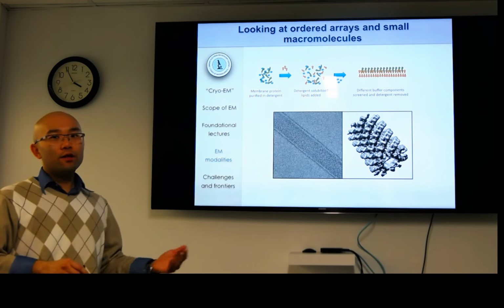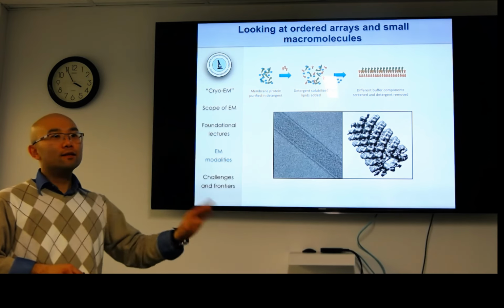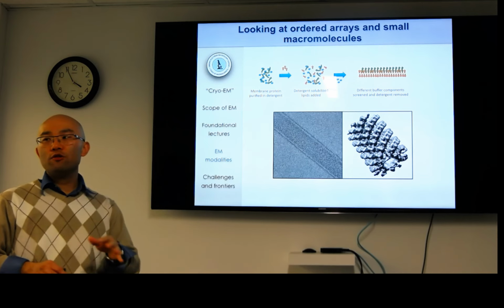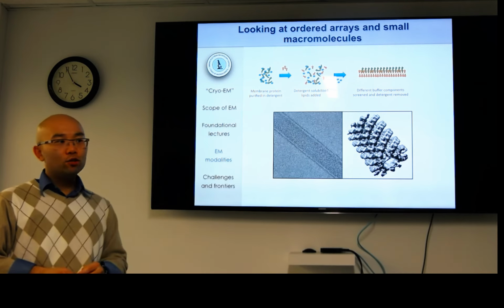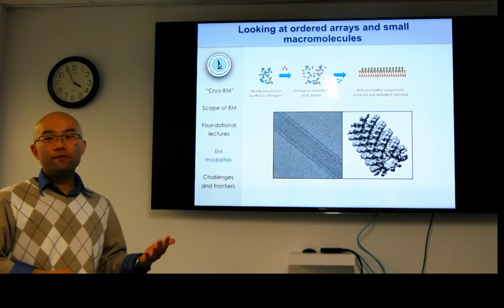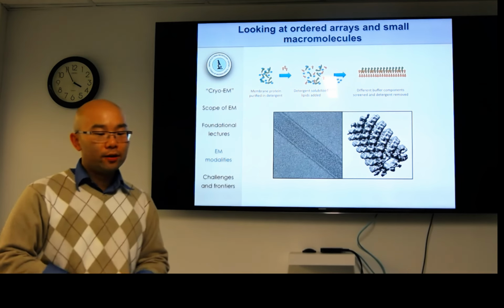Again, with material science, many of these techniques have already been worked out, and you can get atomic resolution when you have high doses. When you have biological samples, you have to be a little bit more cognizant about doses and treating your sample. And so the exciting part is that in the recent few years, by a variety of techniques, we've been getting to near atomic.